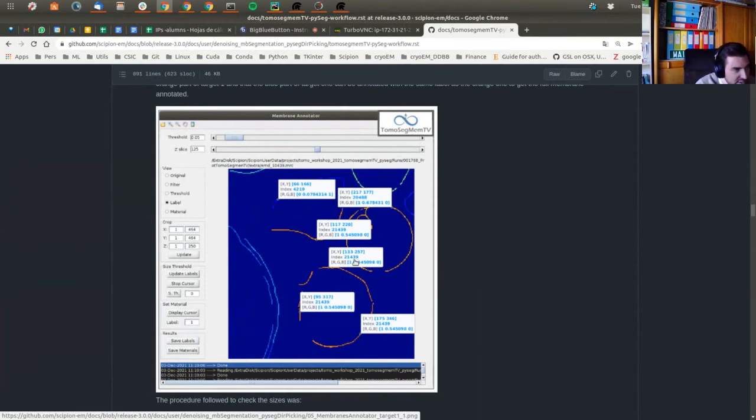So as you can see here, this one has a different value than this one. This one and this one are this. These other parts are again this. And this part is a little bit different, which makes the value correct. So we have here all this orange with the same value, which is the same structure. All of this has been identified as a different structure, and this is another structure. Since we are now focusing on this one, we are going to annotate first this and this as the same.